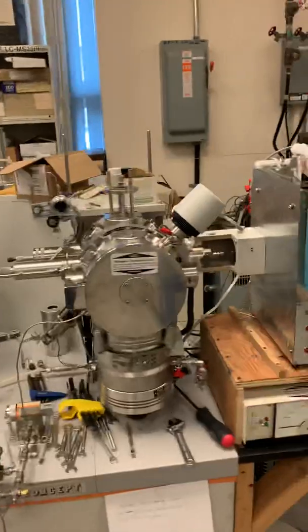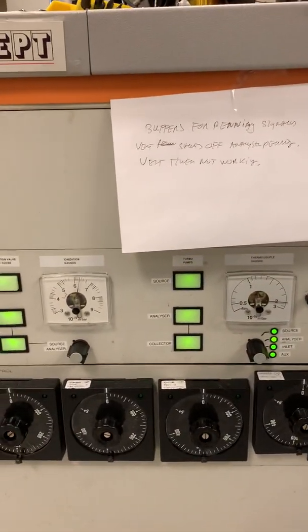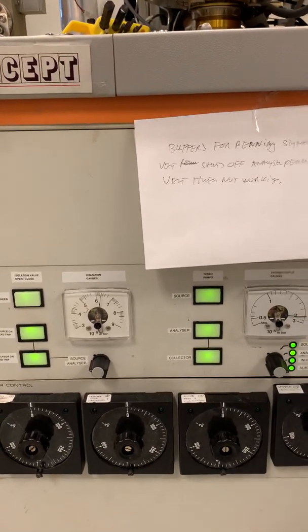Now, in a very old experiment here, the Kratos magnetic sector electron impact ionization mass spectrometer, the gauges are down here and they are manual mechanical gauges. On this side we have the gauge that reads the backing pressure.